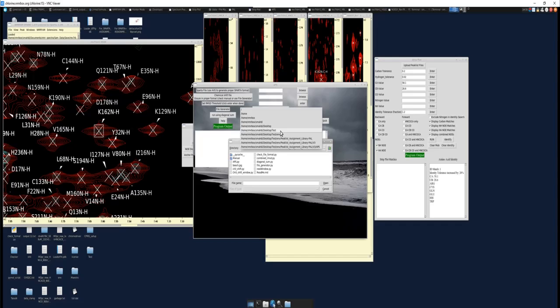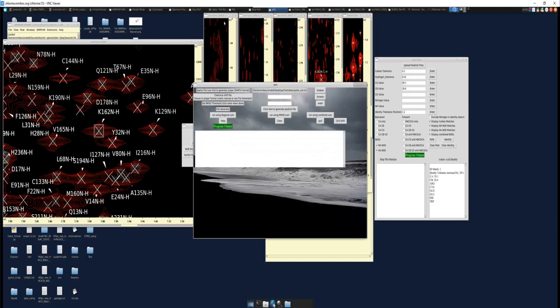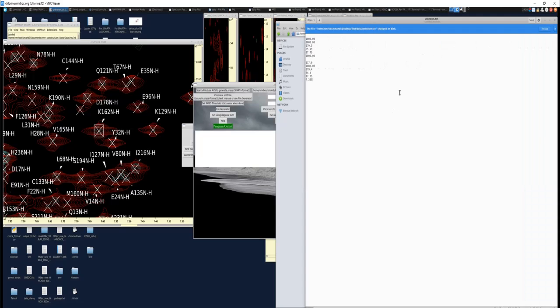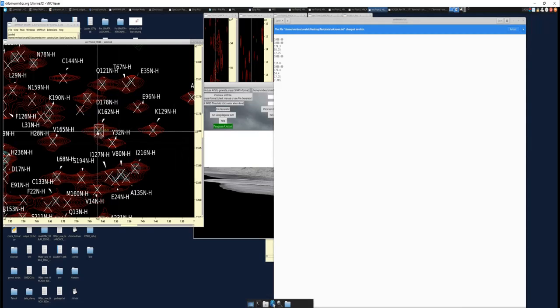And we need to upload our Sparta Plus file. So Sparta out. And let's modify our unknown text file here. Oh, I still have it open. Okay. So let's upload it with the information that we got from here.